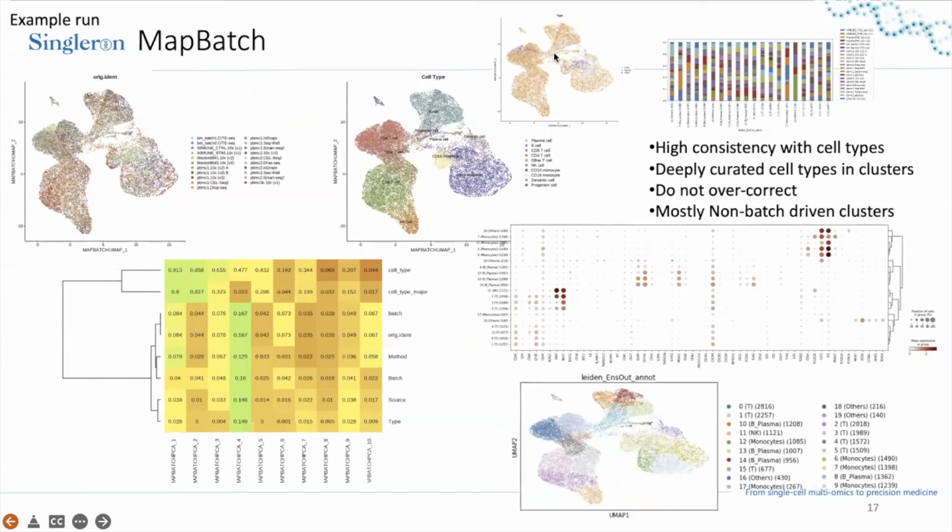But what is the best here is when we observe the UMAPs, the disease-specific cells are partly embedded in the normal cells, and still there are some parts of them, especially those small rare cells, that still stand out. And later when we do clustering, we may be able to capture them. So it makes MAP-Batch a really good tool when you want to capture small rare cells, specifically something that has, for example, prognostic power with regard to the diseases. So we highly recommend this tool, and we will try to find such things in your studies.